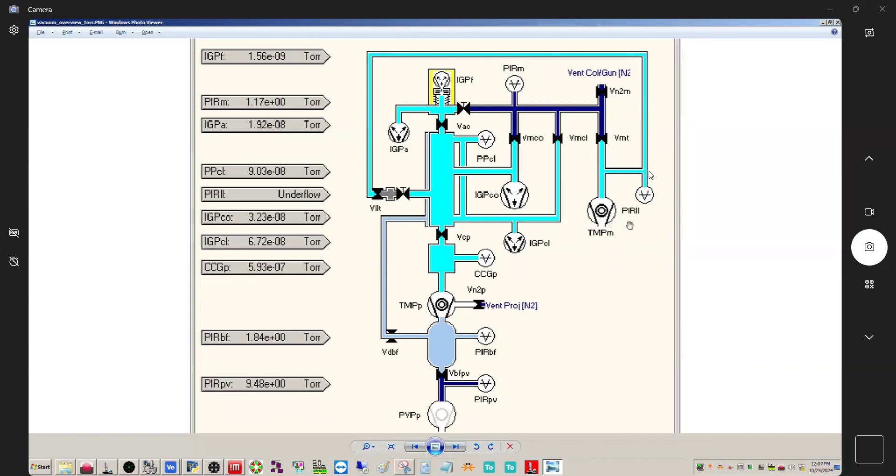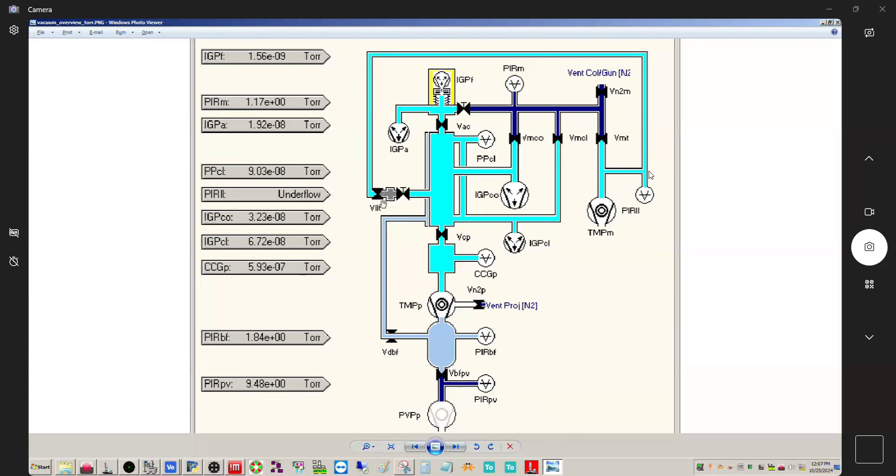So the airlock has its own gauge, which is the Pirani LL here. And if you follow this around, so this little gray section here, this is the airlock area. So when you're pumping out the airlock, this valve here, VLLT is opened and this is being pumped out. Once it's pumped out, this closes. And then when you insert the holder, you open up this valve. So this is the manual valve that has to be actuated manually to introduce the holder into the column.